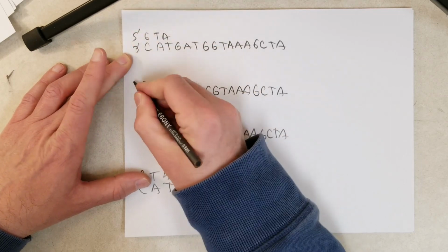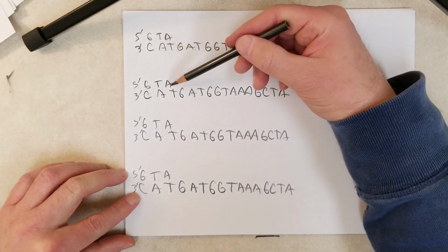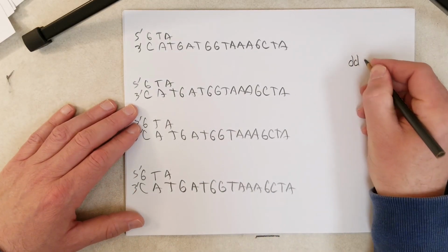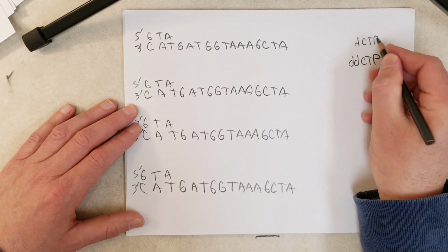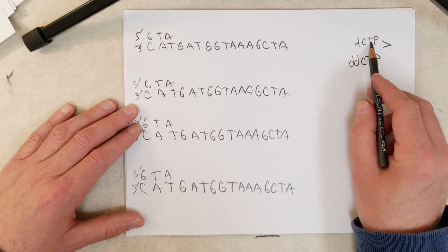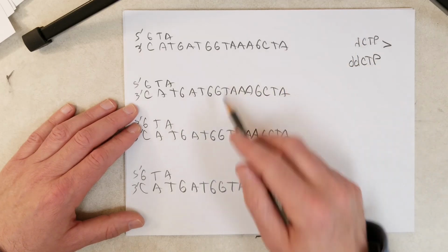So I guess I'll put the 5' and 3' in. So same setup as before. The primer is annealed to the templates. And this time we are working with ddCTP, which is found at a lower concentration than the analogous dCTP. And keep in mind, all the other dNTPs are there. It's just the ddNTP, which is only present in one form, and that's ddCTP in this reaction.